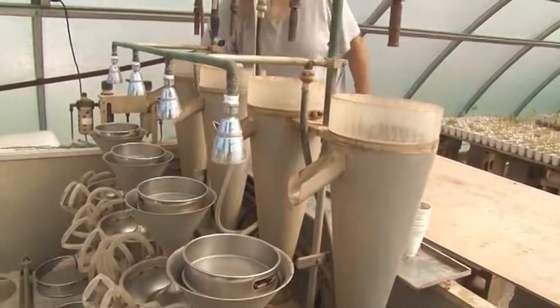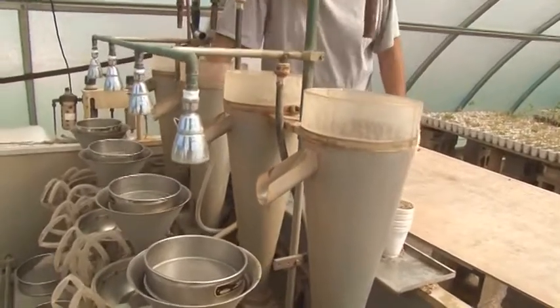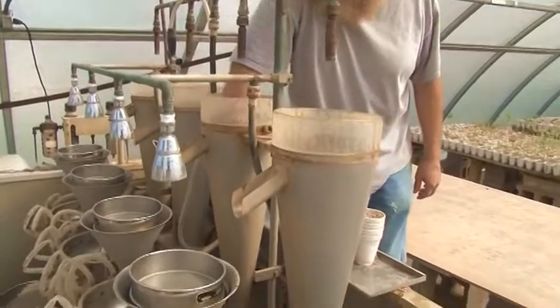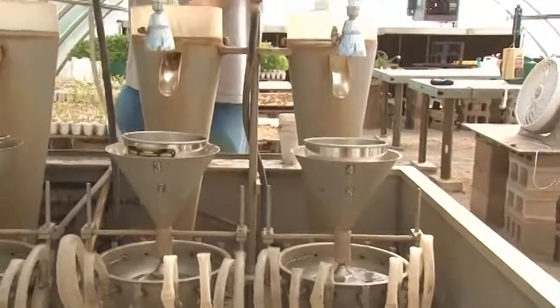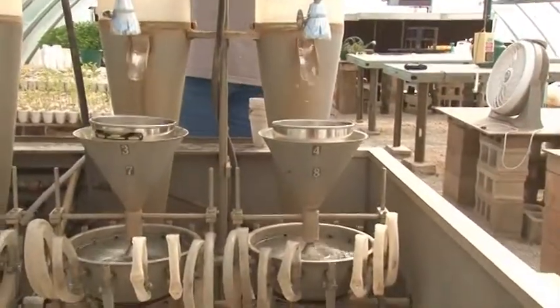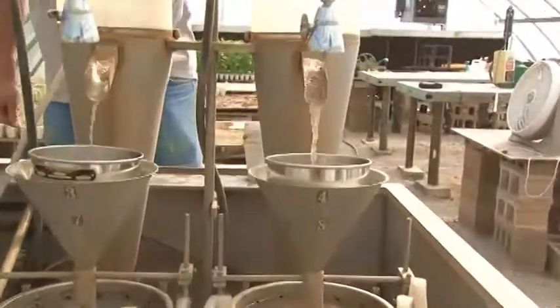A little orientation. The nematodes and the soil go in and are mixed with water and air. They cascade over a series of sieves — a large one to trap all the big particles, large sand particles, and roots — and then into a sample splitter. And then ultimately we catch the cysts and the nematodes on the fine mesh sieve.